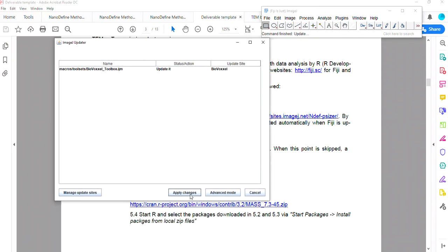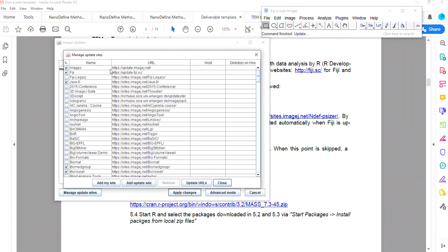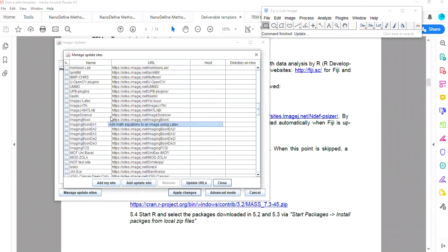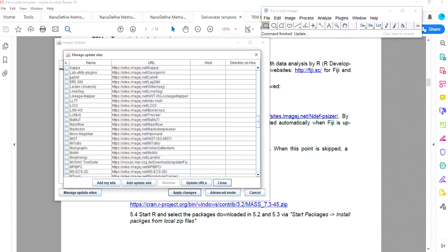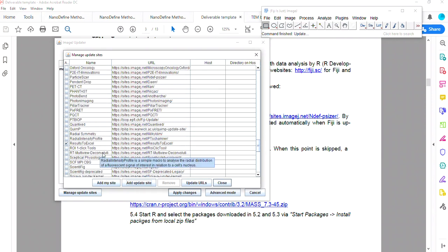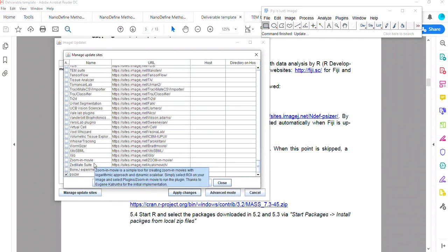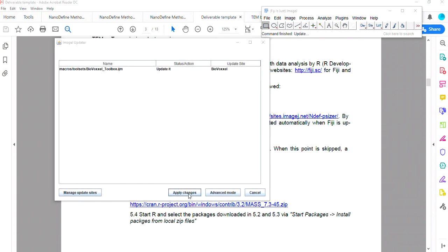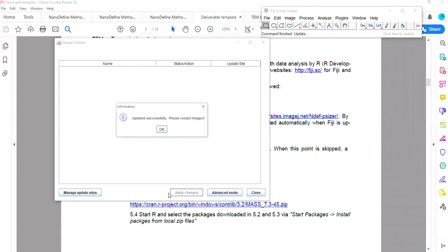Here is where you'll want to manage the update sites. You'll want to click on a few of these. It's all written down in the information, and also add this one manually: P-sizer.